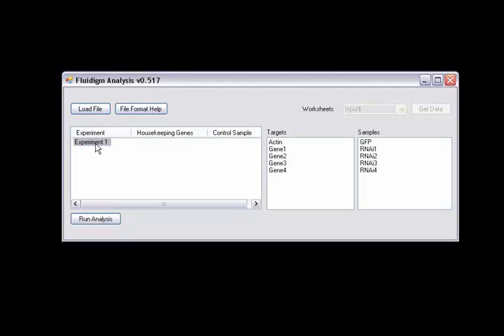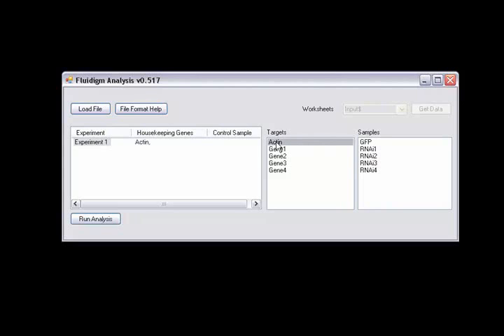As you can see, I have my experiment over here. Each experiment, when selected, will load the targets and samples associated with it into these boxes here. Then I have to select a housekeeping gene. For this experiment, it's actin. And then a control sample which is GFP for this experiment.